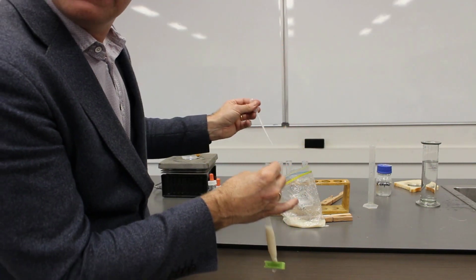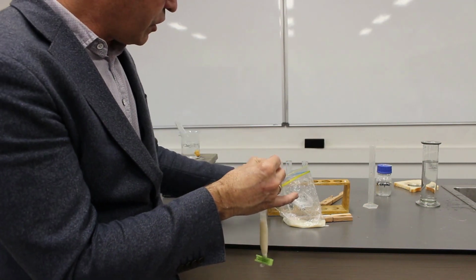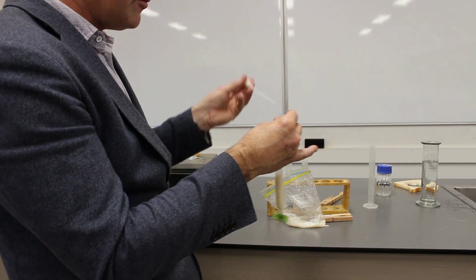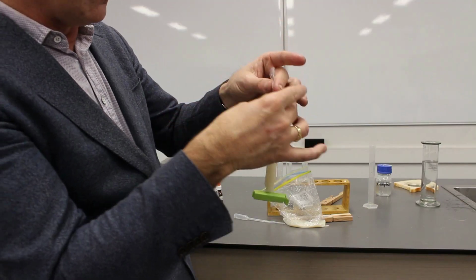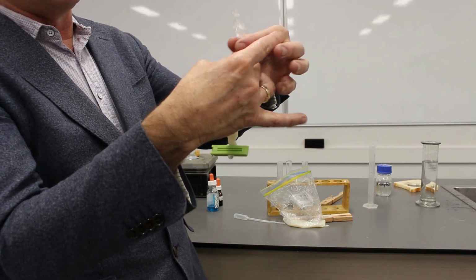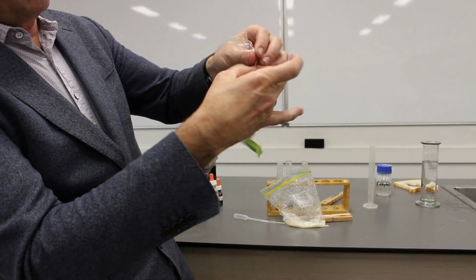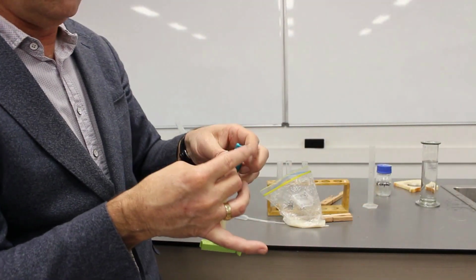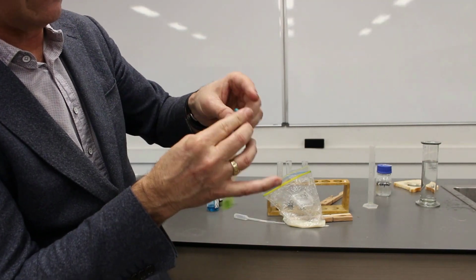So what's going to happen is the amylase is going to continue to break that starch down into glucose. And that glucose is going to be small enough to be able to go through the small holes in this tubing. Now, what we're going to do is just leave a little bit of an air space, a little bit of a gap there, and then give it a twist and a fold, and we're going to seal it again at the top. Okay, so the amylase is going to work away, and that's sealed up there.